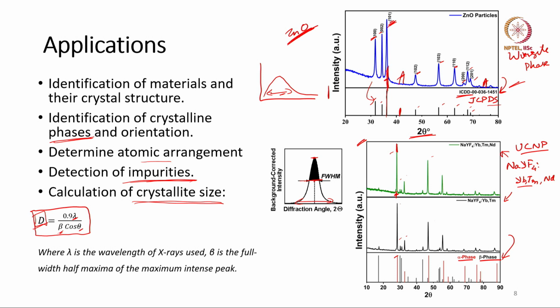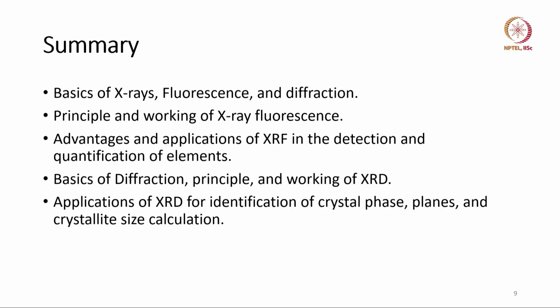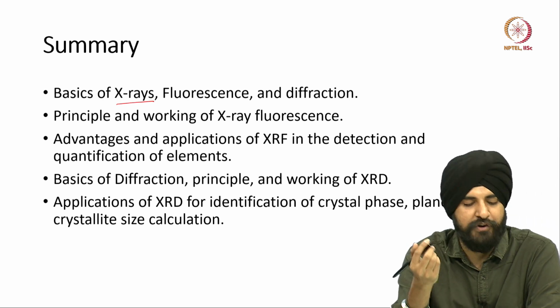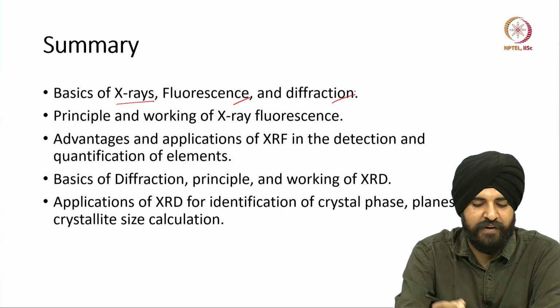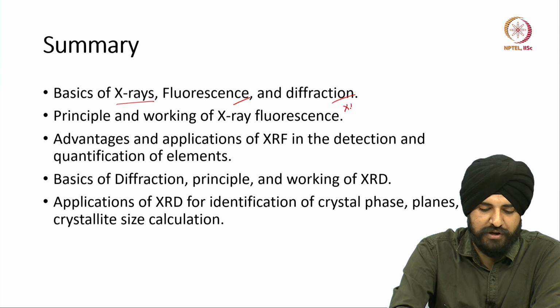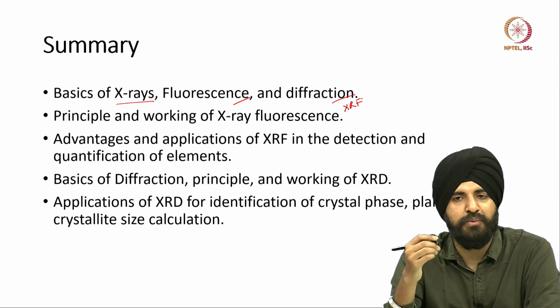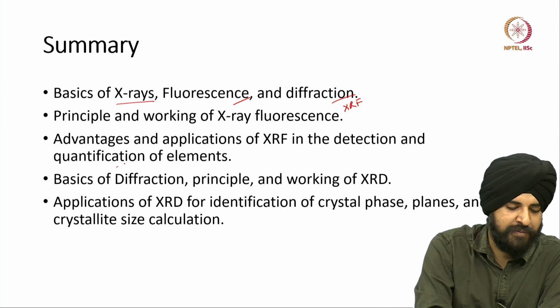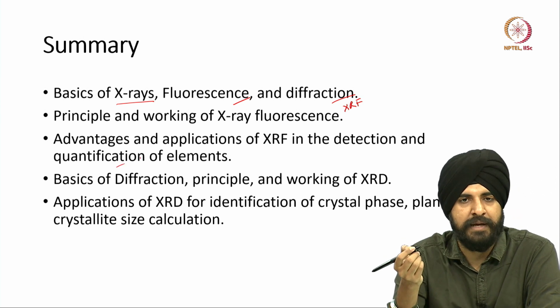Talking about all these applications, we will now summarize what we learned today. What we learned today was the basics of X-rays, what X-rays are and how they can be used for two different phenomena, which are fluorescence and diffraction. We studied the very basics of XRF, the basic working mechanism and how it can be used for the quantification of unknown samples.